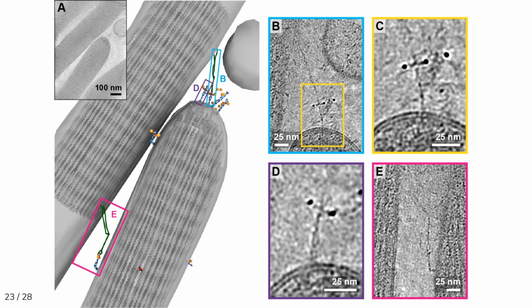But another very interesting feature we saw further down the two stereocilia was another structure like a tip link, like a protocadherin 15 connected to a cadherin 23 molecule. And in this case, it looks very consistent with the idea that tip links are generated by motor proteins at the base of cadherin 23, which pull a tip link complex to the tip of the stereocilium.